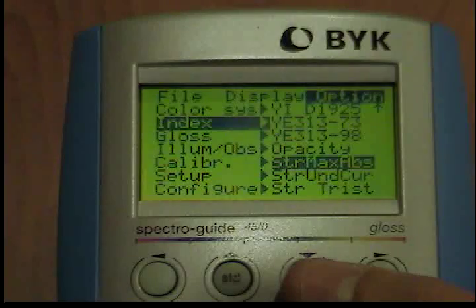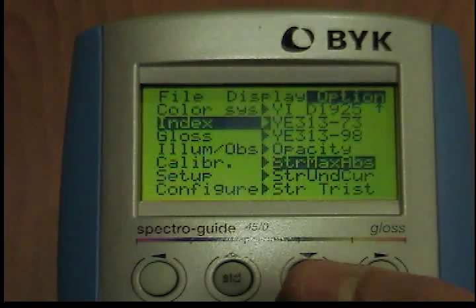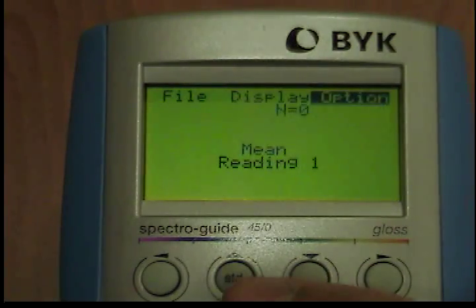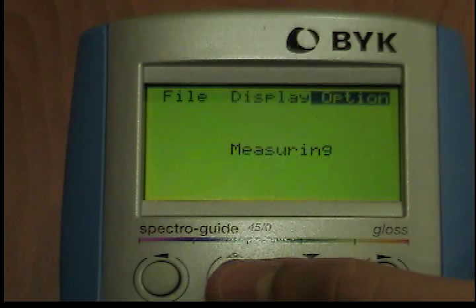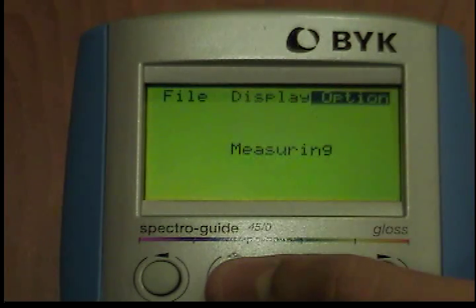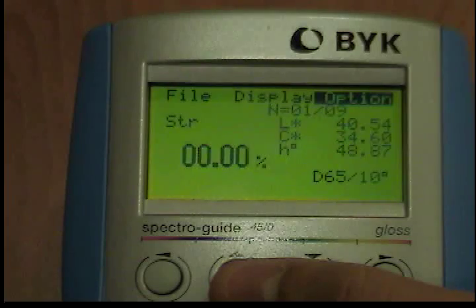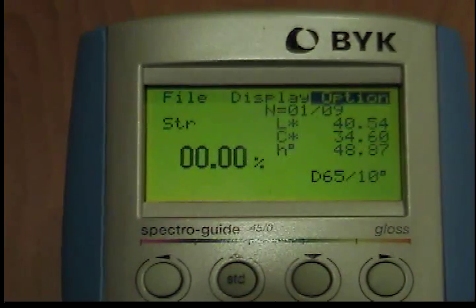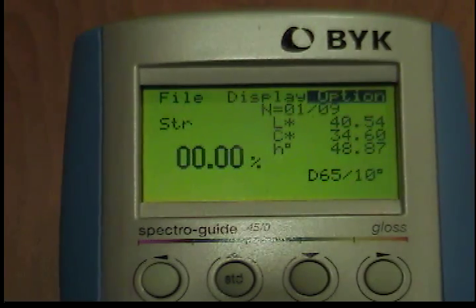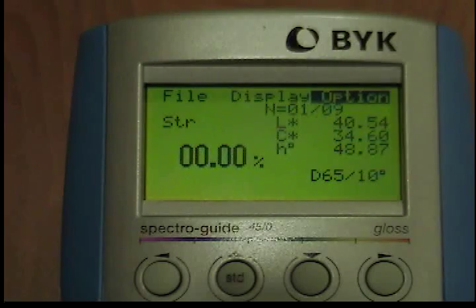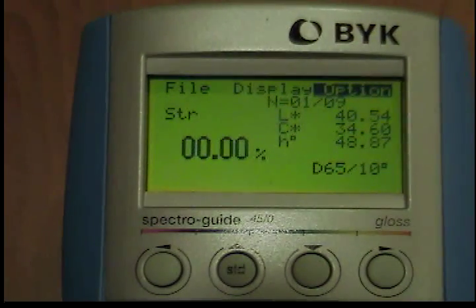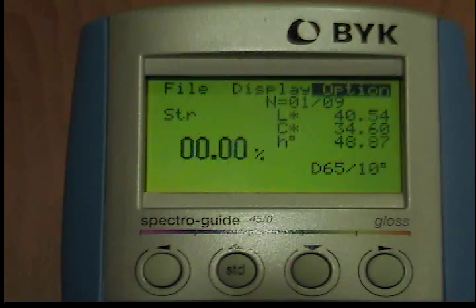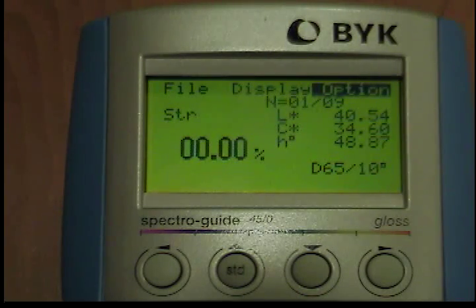After measurement has been performed with the standard button, the Color Strength is zero, and the L*, A*, and B* values for the sample are displayed. After measurement has been performed with the operate button, the Color Strength is displayed. The display also shows differences between the standard and the sample after theoretical Color Strength matching has been applied. If you choose to store the reading with the FileSaveSample function, only the sample will be stored. However, sample difference in color strength can be printed.